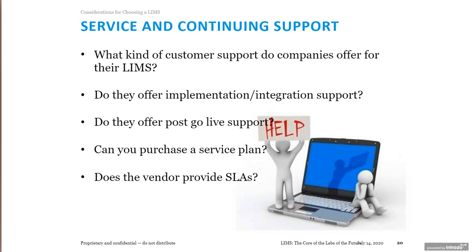And very important, does this vendor offer a service level agreement, like a 24/7 follow-the-sun service? So there are many considerations, as you can see, once you decide that it's time to acquire a laboratory information management system, to ensure you select a vendor that, as I say, has your back.